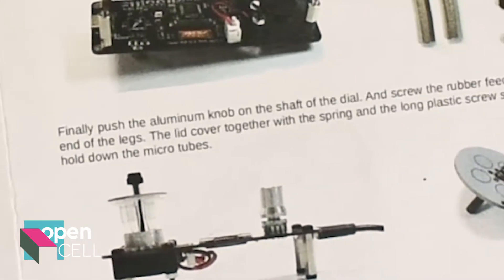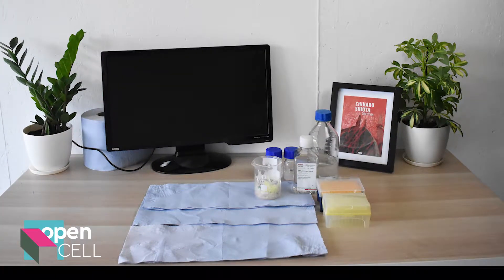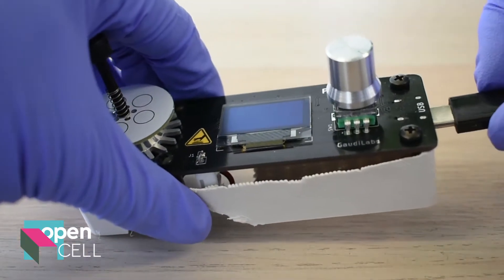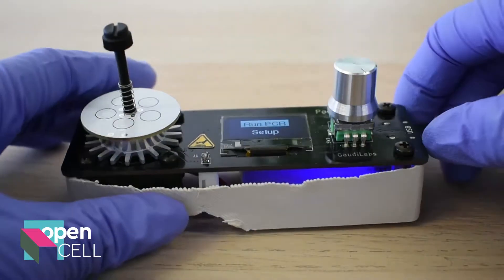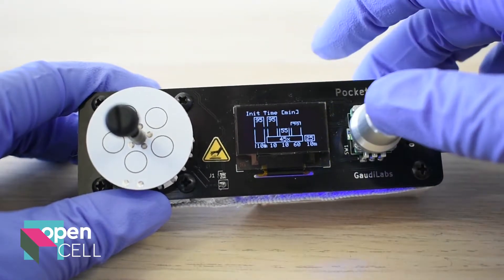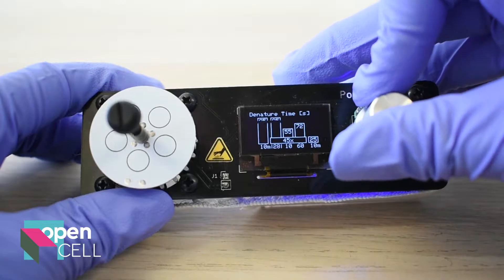For power, all you need is a standard USB-C cable and you're good to go. Set up just as you would for a standard PCR reaction with your reagents, your equipment and your DNA of interest. Just twiddling the dial on the right, you can easily adjust the settings for temperature, which ranges between ambient to 99 degrees Celsius, as well as the time spent and the number of cycles to amplify your DNA.